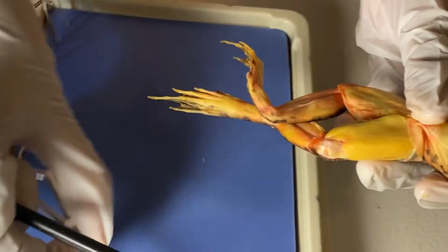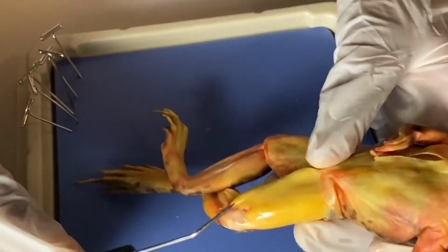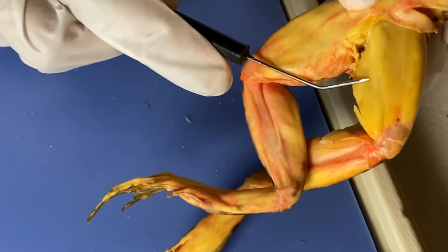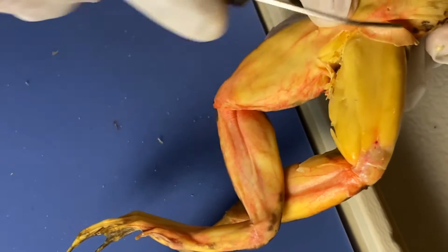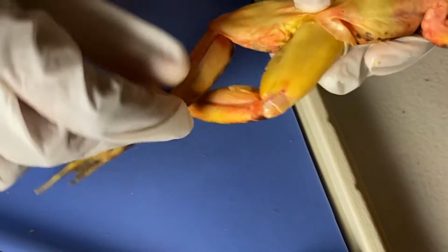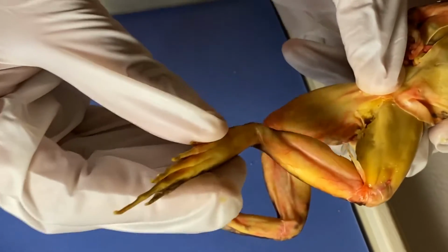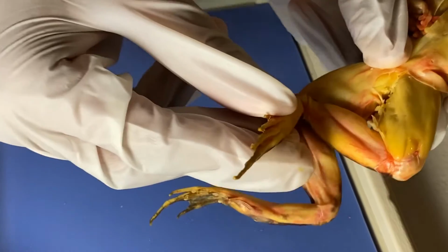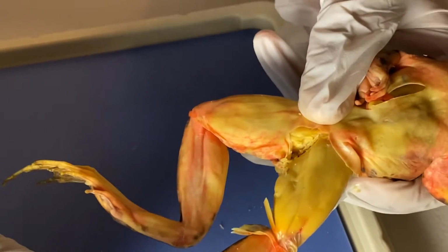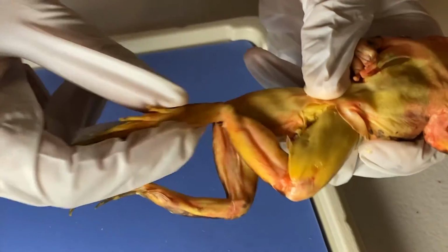So we are going to talk about two muscles here, the flexor muscle and the extensor muscle. So over here would be the flexor muscle, and here is the extensor muscle. Now, why do they have these names? So what the flexor muscle does is it helps the leg flex inward. And what the extensor muscle does is it makes the leg extend. So this is extension, flexion.